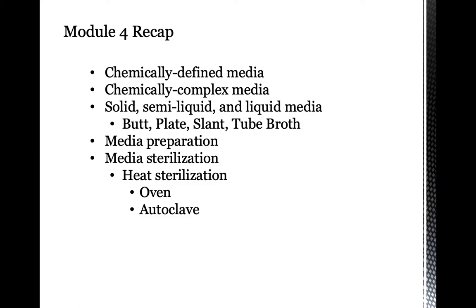Aside from the categorization based on components, we also have culture media based on form. So we have liquid, semi-solid, or semi-liquid, then the solid forms.